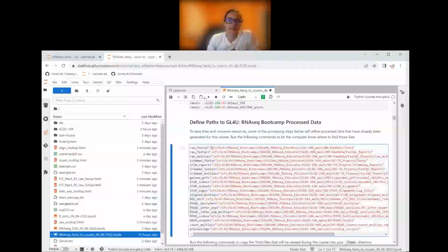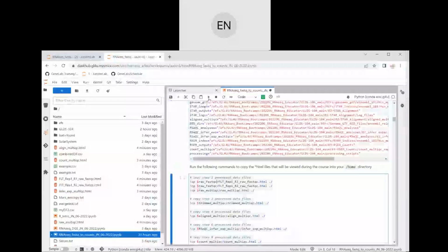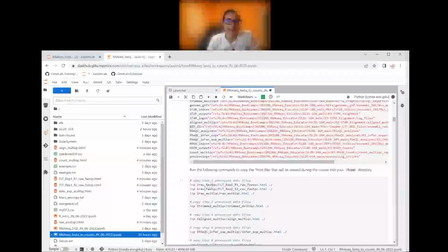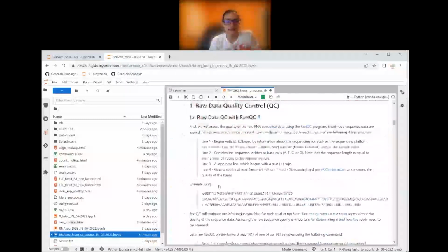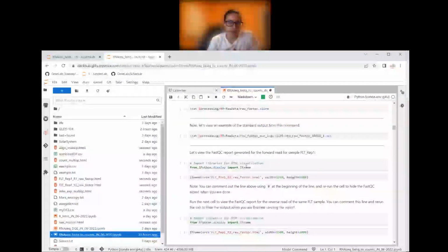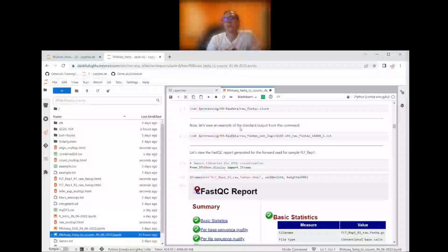Okay, well let me run this again. See, now it says 1, so it ran. Now it did 1, which it wasn't doing before. Okay, so now I can run this one. You don't have to because those are all populated already, but it's okay if you do. Then scroll all the way down to the iframe commands. Go ahead and run it, and then run the next one. Ta-da! Wonderful.